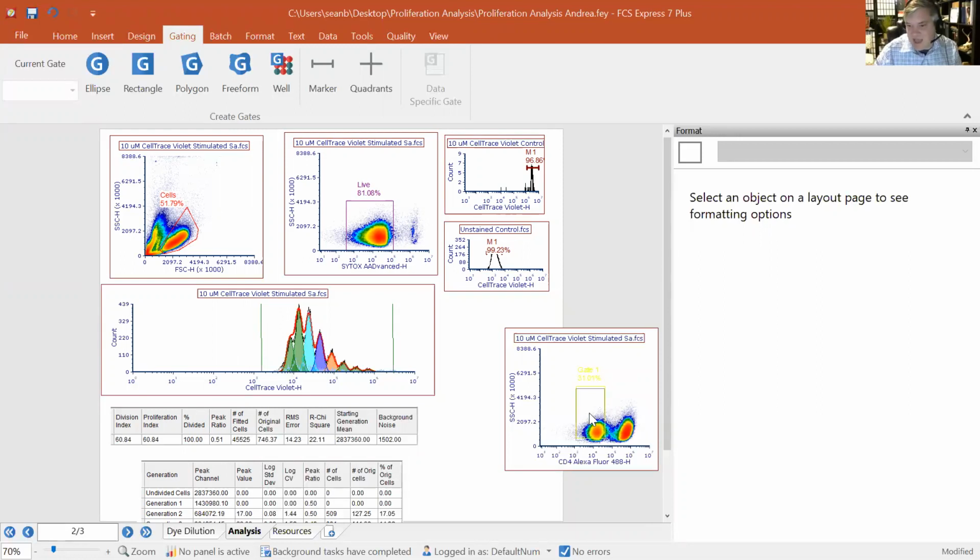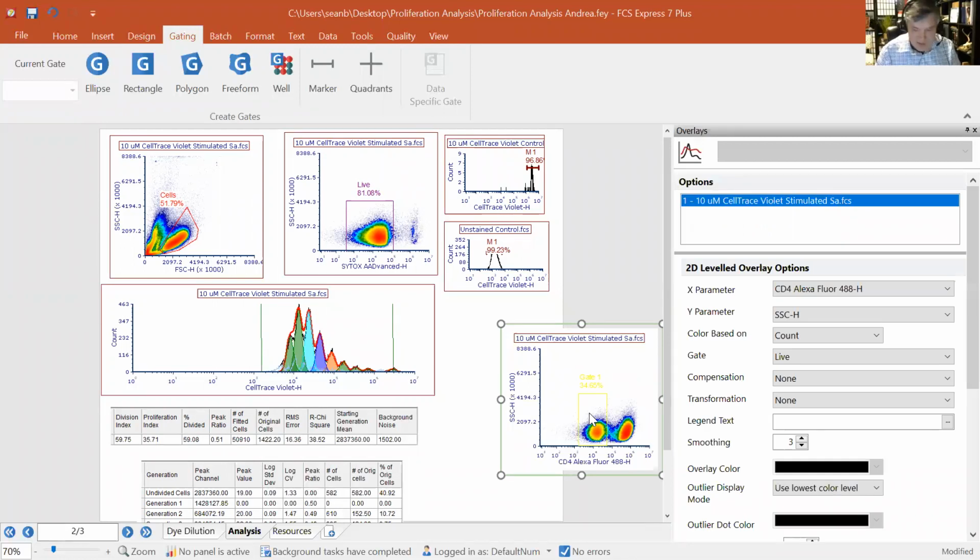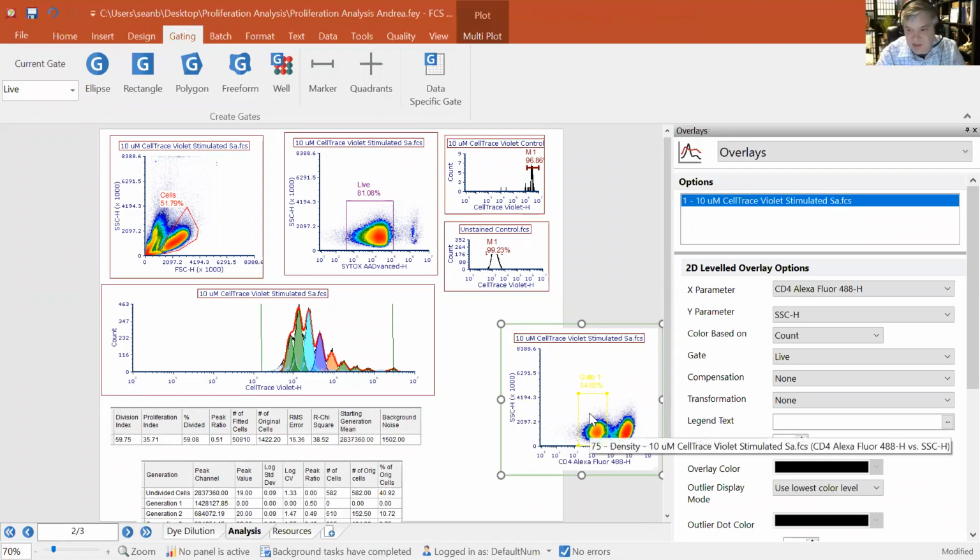So there's nothing that you need to add on to the software to go in and do anything. It's all going to be here. And really, what I can say from personal experience, I used to run a lot of these assays back in the day. If you can go to the core facility and get as much information as possible about pitfalls and ways that you can optimize your experiment before you even start running one of these things, the better. Otherwise, you might spend weeks or months trying to optimize your assays so that you can get the data to look like this, to get it into some reliable context for analysis and also a reliable context for publication.